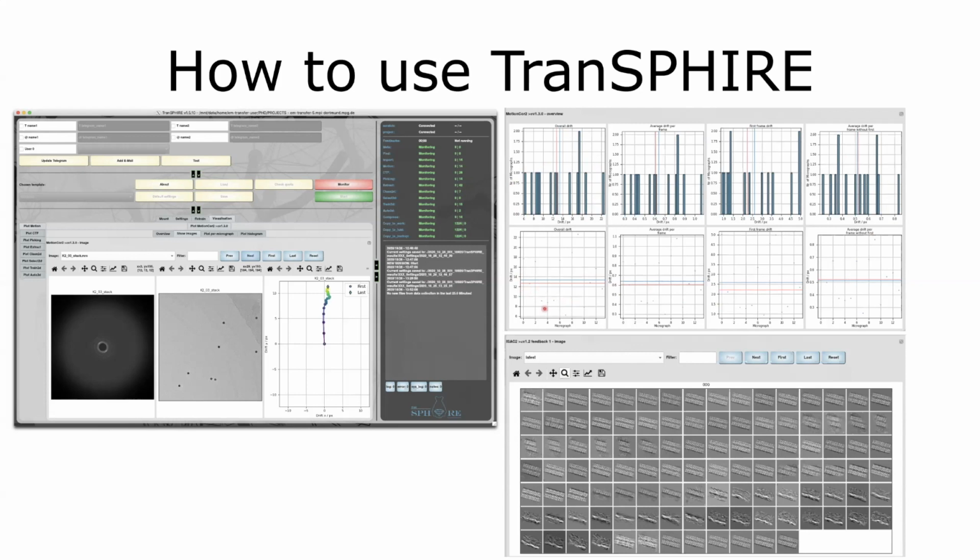For every micrograph, you can see the average drift, the median drift, and this for every metric available for motion correction, CTF estimation, particle picking. So you can see everything at the same time. You see live all the class averages, picked images. So it's very useful to evaluate whether this data acquisition goes somewhere, or whether I need to change some settings to make it more optimal and to get the most out of it.